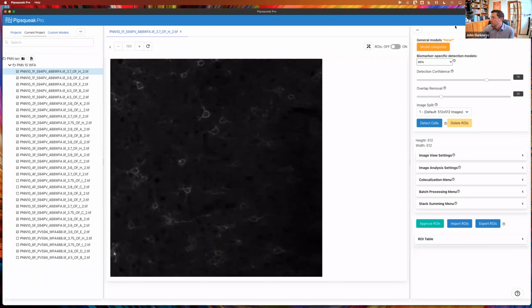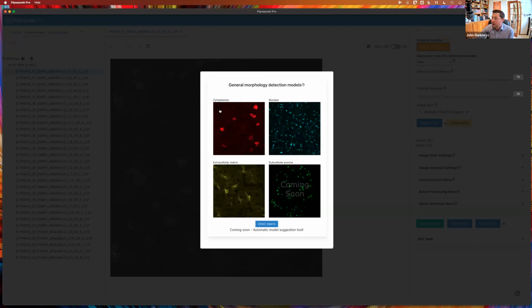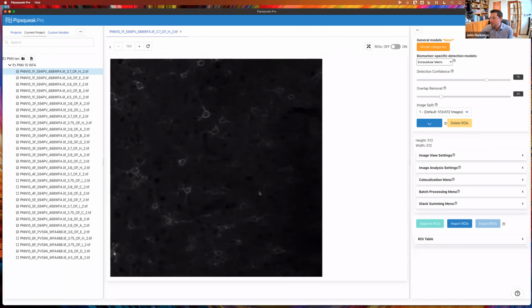All I have to do is go up and choose the type of AI that I want to point at it. I have a couple of ways that I can do that. I can go into our new morphological selector and basically choose the type of thing that I'm looking for. Here, we're distinguishing our AI between large circular objects, small circular objects, and in this case, non-circular objects. This fits what I'm about to do, so I'm going to choose that one and press detect.